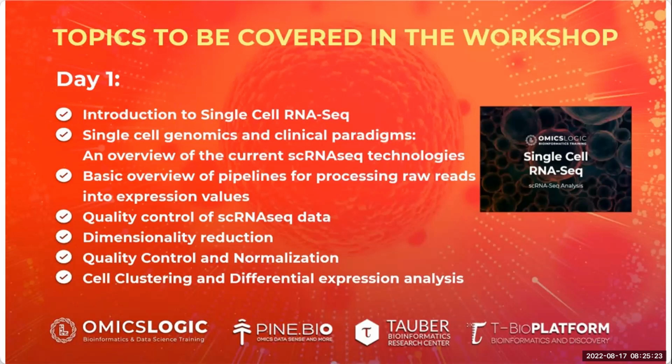We are also going to get introduced to the typical analysis pipeline, where you will pre-process, quality control, and normalize the data, and you can apply dimensionality reduction, further clustering of cells, and differential gene expression analysis performed for the different types of cells, which will help us understand the biology behind the relevant questions and relevant samples. So without further ado, let's get started.